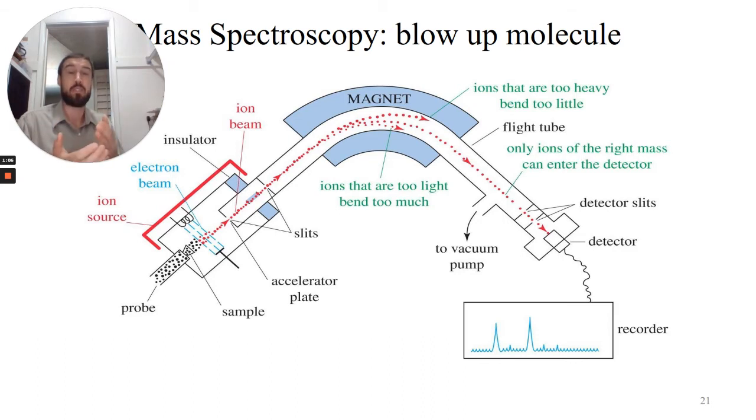Except in the case of the mass spectrometer, we're not analyzing just a single explosion. We're analyzing probably upwards of millions and billions of explosions because we're looking at molecules. We put a small amount of our sample in, remember how tiny moles are, and then the mass spectrometer explodes all of those molecules. Those molecules will all break apart into varying pieces.